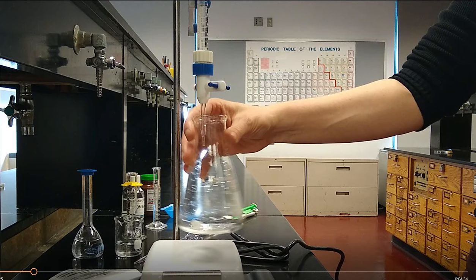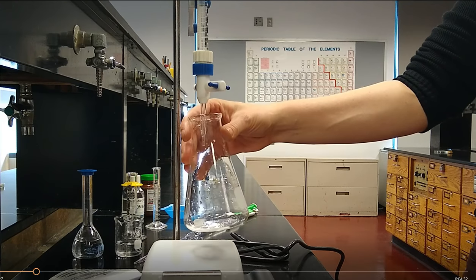The solution that goes into the Erlenmeyer flask is called the analyte. You can think of that because we're trying to analyze what's in that solution. We'll be doing two different sets of titrations with two different analytes. First, our standardization titration will be using KIO3, potassium iodate, aqueous. During our unknown titration, your analyte is going to be a diluted bleach sample. We're going to be analyzing the sodium hypochlorite in that sample, the NaClO.